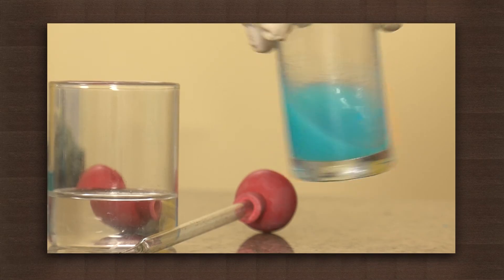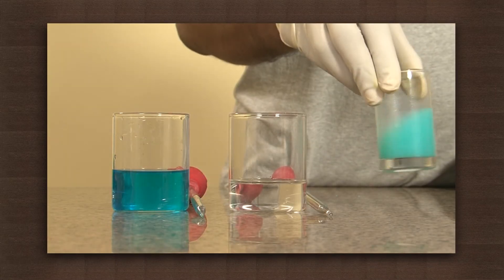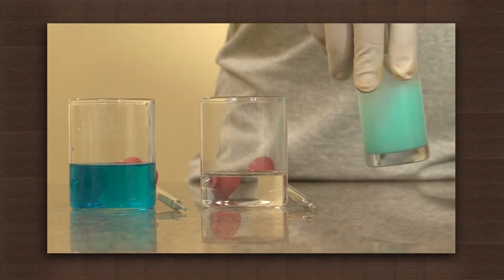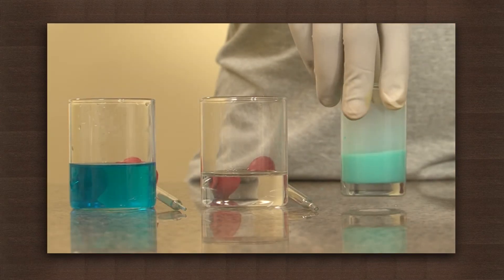It turns green. This is because copper hydroxide is formed. Green is the characteristic color of a copper salt.